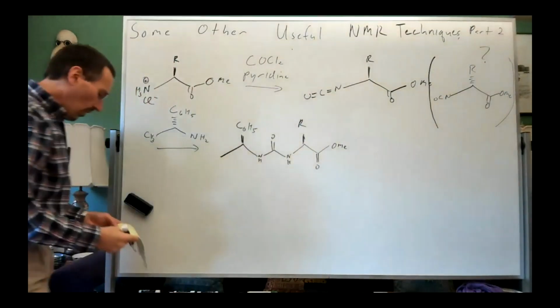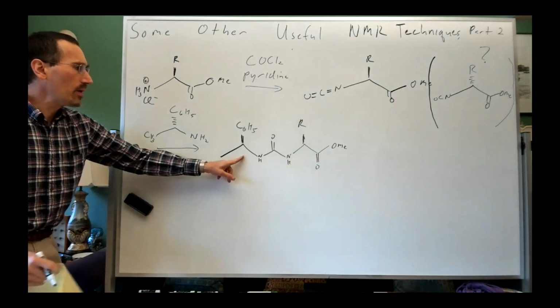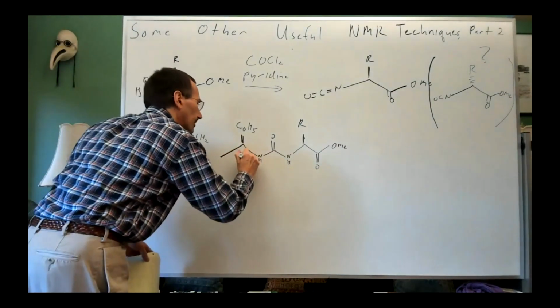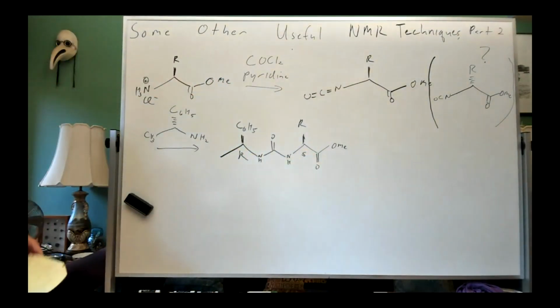All right, so on the one hand, we might have a molecule where we have an R stereocenter and an S stereocenter.